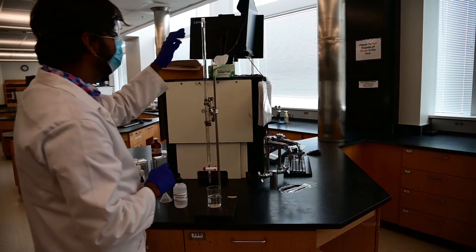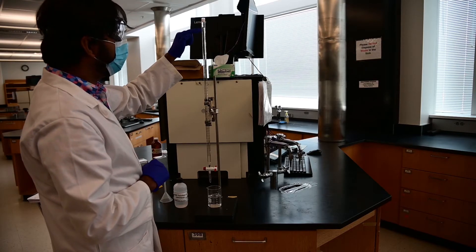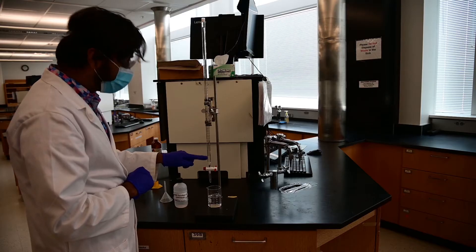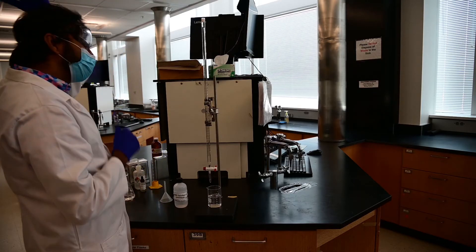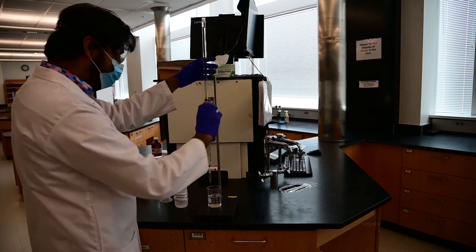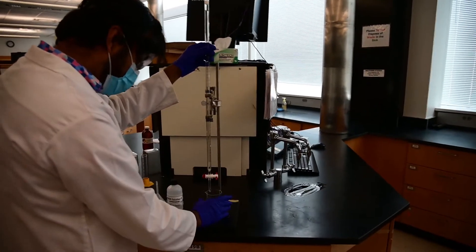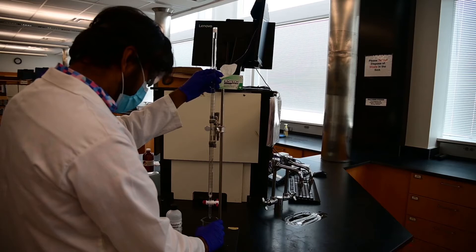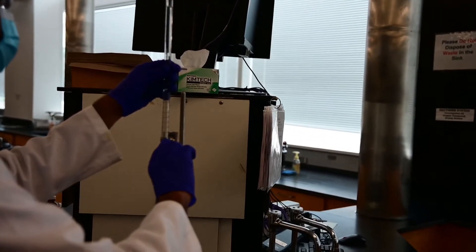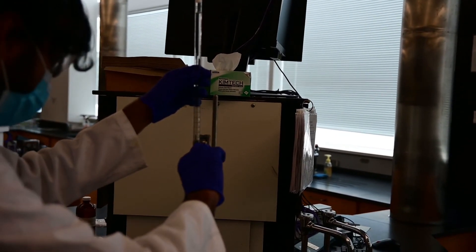For burette, the zero mark is here on the top and the 50 mark is at the bottom. And now if we zoom in, we will see that our NaOH is above the zero mark. So I have to adjust that level.